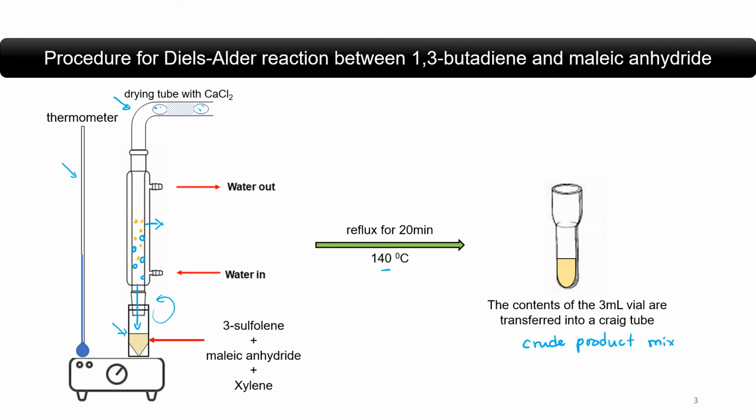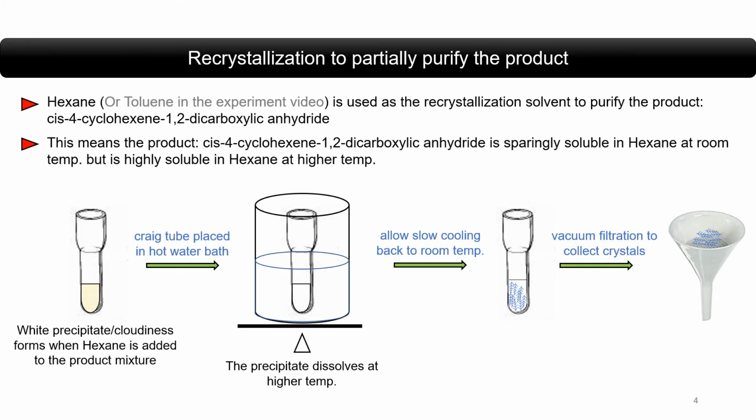because there might be some contaminants, impurities that come from the solvent, maybe remaining reagents, and like that. So we are going to use recrystallization in order to purify our product. That is what we will follow in the next slide.